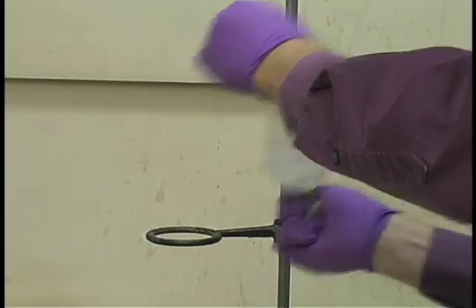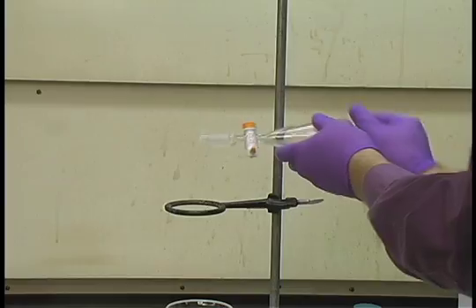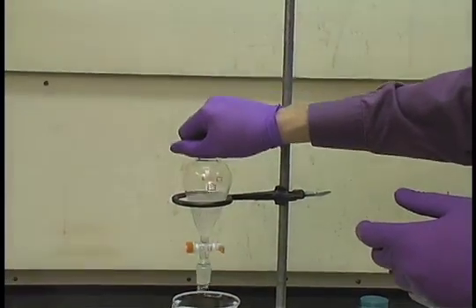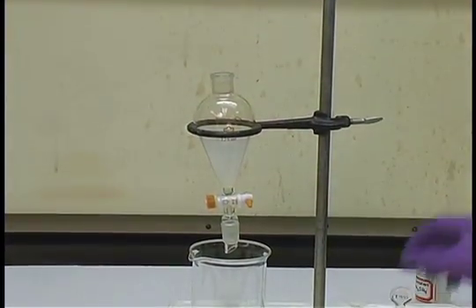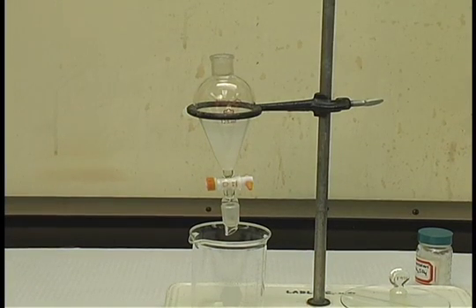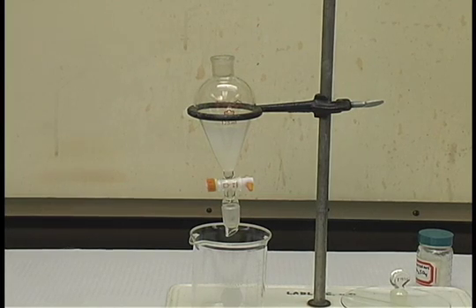After one minute and venting, return the separatory funnel to the ring and remove the stopper. Allow the separatory funnel to stand for about a minute in order to allow the two layers to separate, and you will see a definitive boundary shortly form.